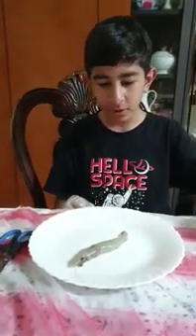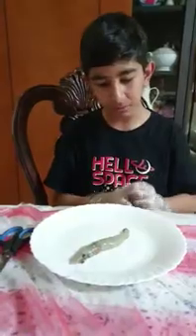Hello, today we're gonna dissect the shrimp. So let's talk about the shrimps.